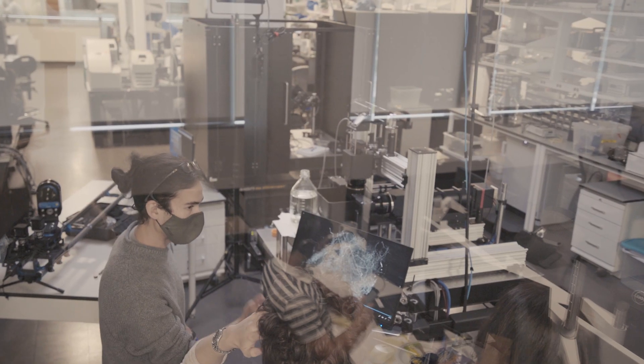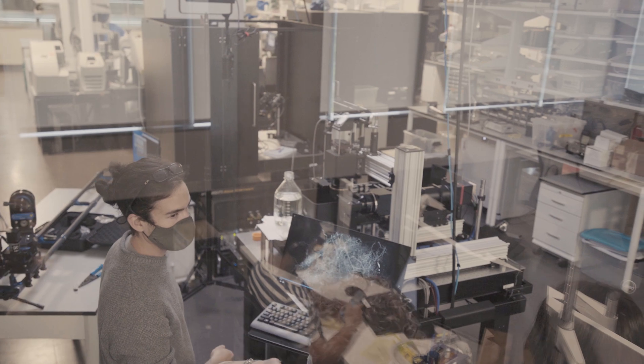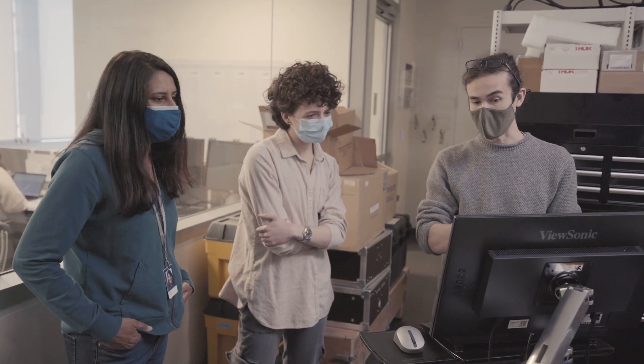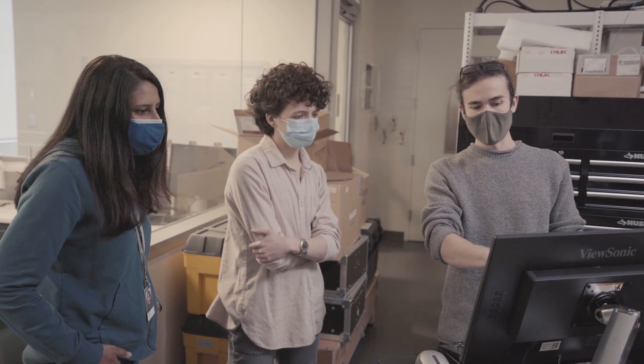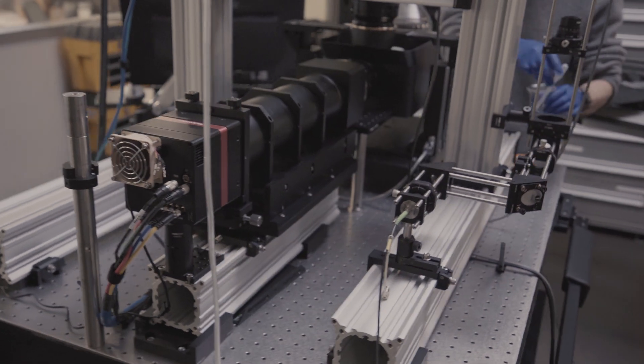At the moment we have multiple different microscopes in the works and this one was by far the riskiest and the one which required the most research and development.